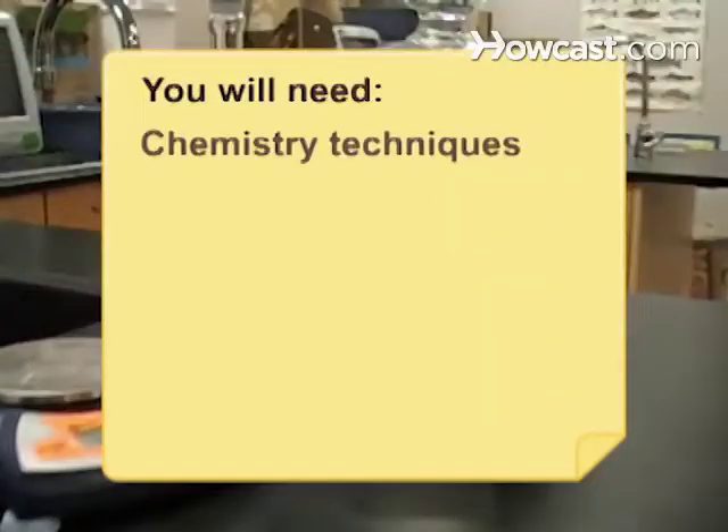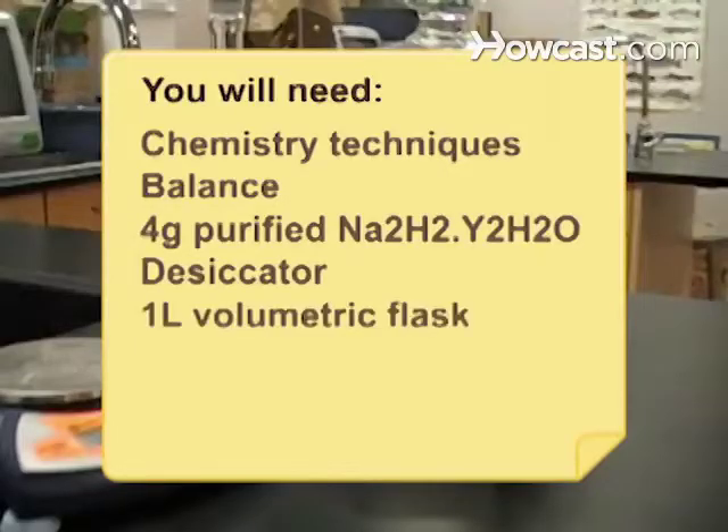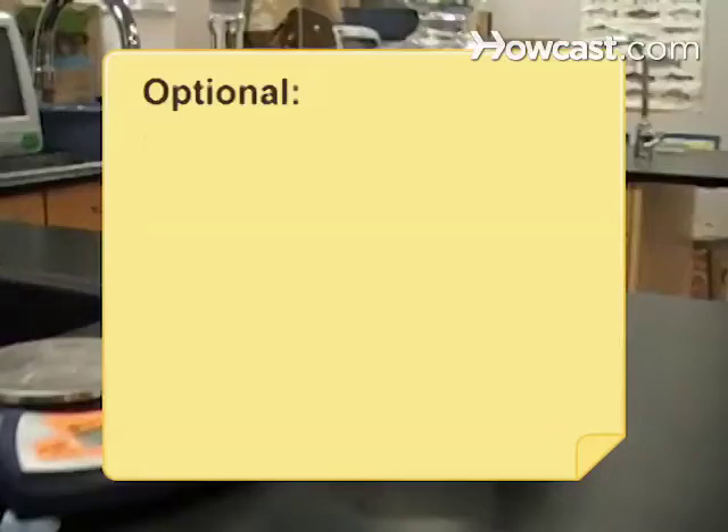You will need basic chemistry techniques, a balance, 4 grams of purified dihydrate ethylenediamine tetraacetic acid, a desiccator, a 1-liter volumetric flask, a powder funnel, and 1 liter of deionized or distilled water. Optional: a non-glass flask stopper.